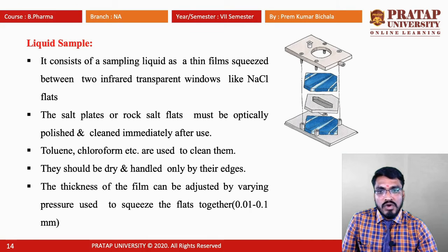The salt plates or rock salt flats must be optically polished and cleaned immediately after use. Generally, toluene and chloroform are used to clean them. They should be dried and handled only by their edges. The thickness of the film can be adjusted by varying the pressure used to squeeze the flats together. Generally, a film thickness of 0.01 to 0.1 millimeter is used for the determination.